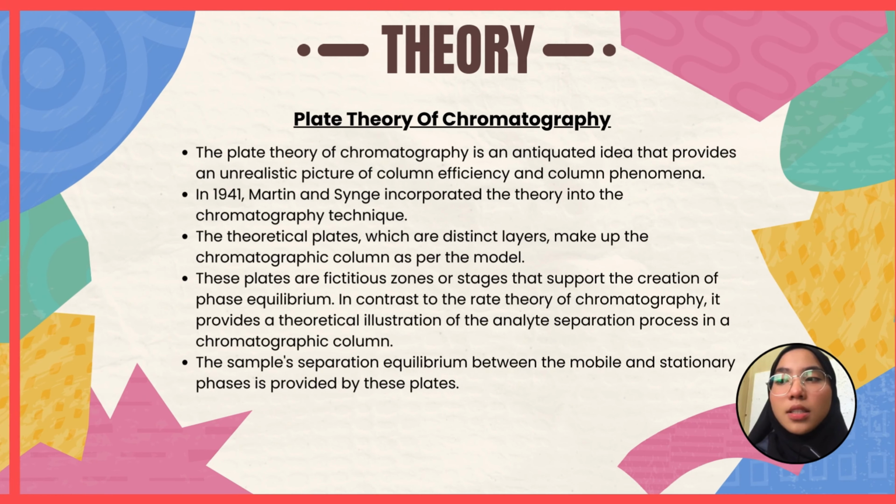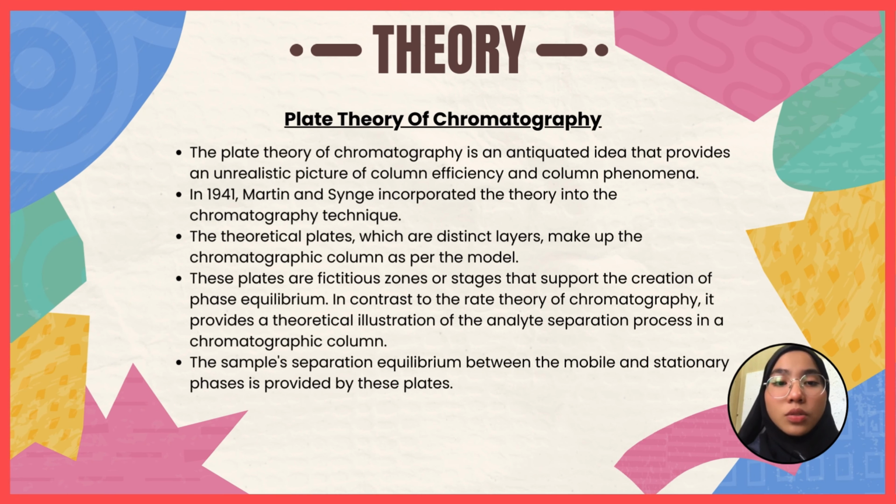Okay, next, this is the plate theory of chromatography. The plate theory of chromatography is an antiquated idea that provides an unrealistic picture of column efficiency and column phenomena. In 1941, Martin and Synge incorporated the theory into the chromatography technique. According to the model, the chromatographic column is made up of theoretical plates, which are distinct layers.